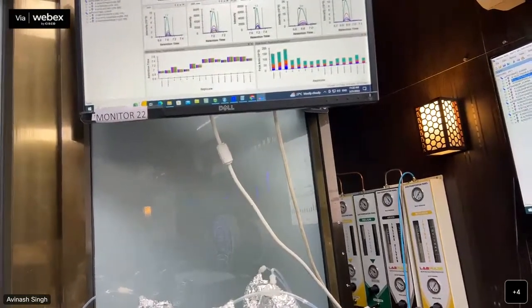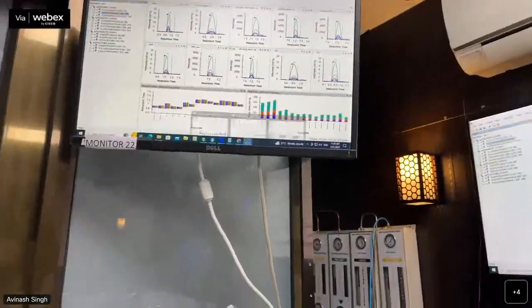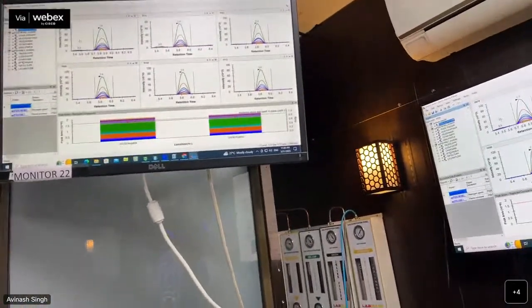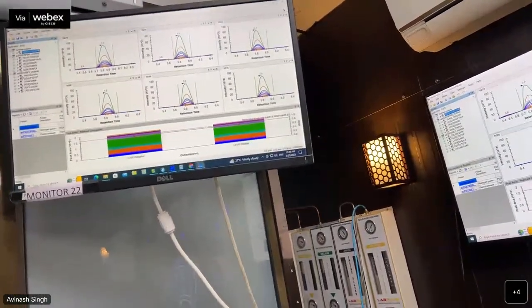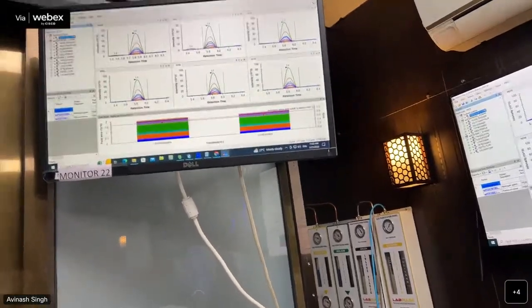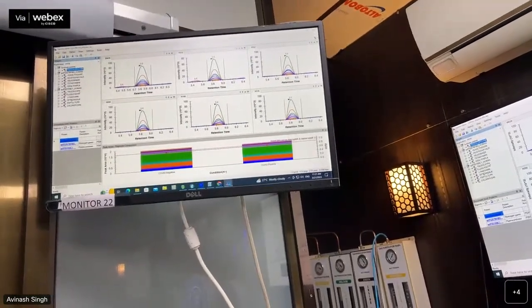The main application of this instrument is that we can monitor, let's say, COVID positive and negative samples, and then we can monitor a protein that is upregulated. Here I will show you one of the projects that we did during COVID time. We inject an internal standard into our sample, in both positive and negative samples, to show there is no variation in the spike peptide.